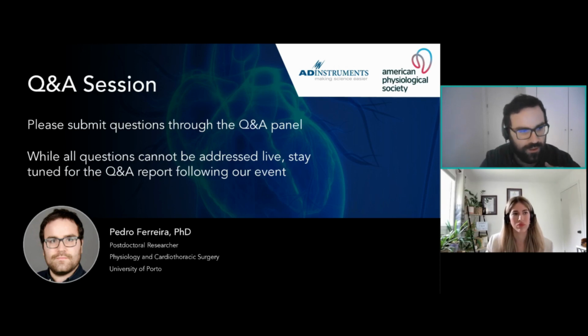I know this is not the answer that the instrument company is looking for, but if you really take care of your catheters, they will work for you for a very long time. We've had catheters that we've used around 50 times until they stopped working. And usually when they stop working is that you lose one or two segments, or your pressure signal has a lot of drift or a lot of noise.